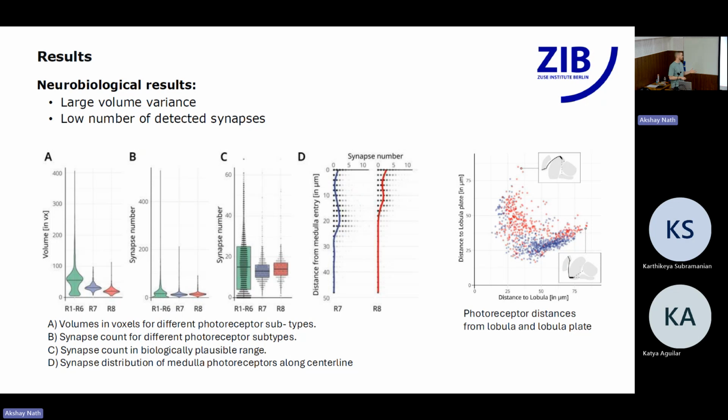One of the reasons could be, as I mentioned in the post-processing slides, that the responsibility to exclude poorly segmented neurons lies with the user. This was not done in this case. As we use connected component analysis, if two binary predictions touch, they would be labeled as a single neuron. From the volume readout, one could exclude them, but this was not done in this case.